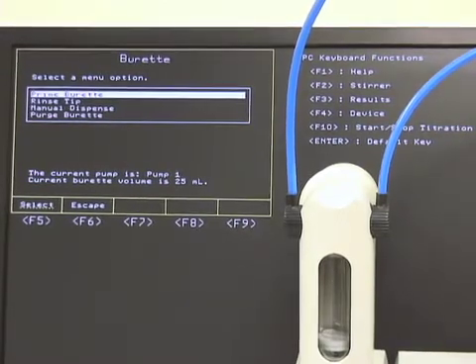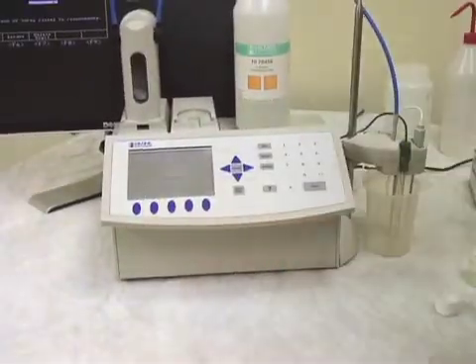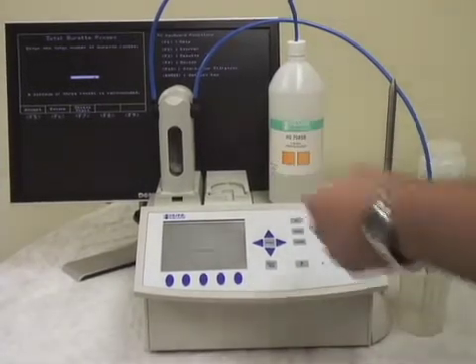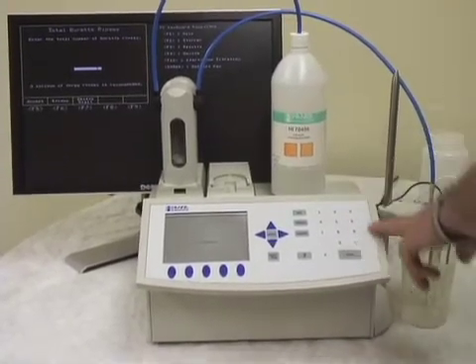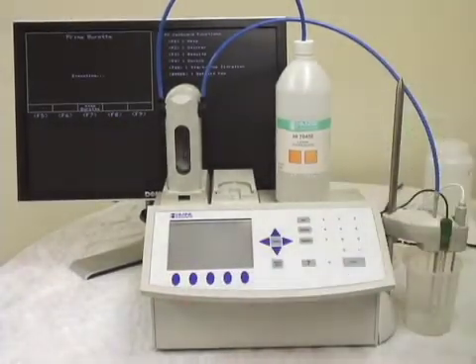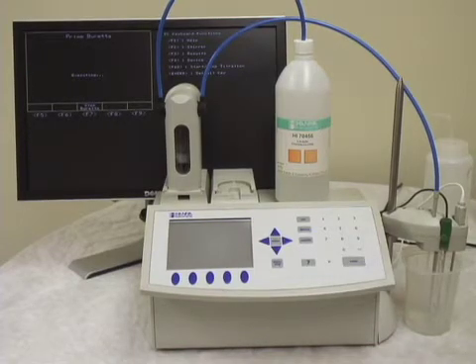And prime burette, which is where we're at. Our tubing's hooked up and we've got a container to catch our titrant. We'll select prime burette, and it's going to ask us how many rinses we'd like to do with the burette. Three is recommended, which is what we're going to choose today. Hit accept, and off it'll go. The burette's going to rise and rinse three times, and then it'll go back to the burette menu.